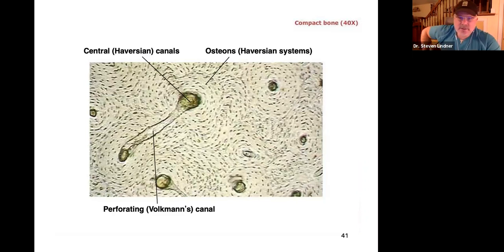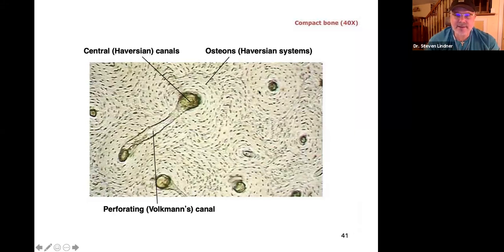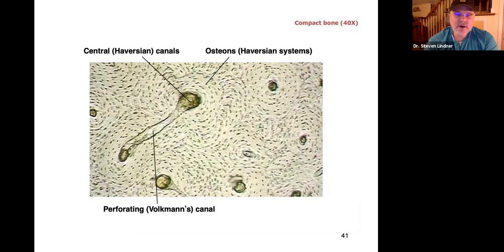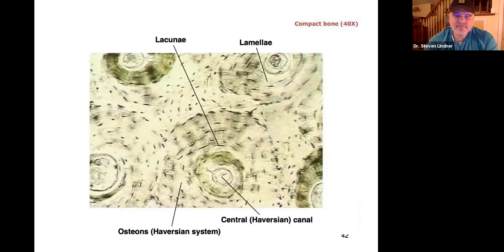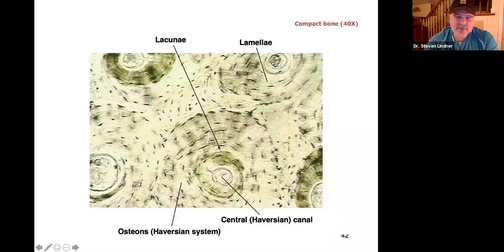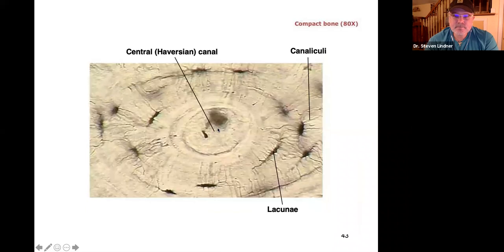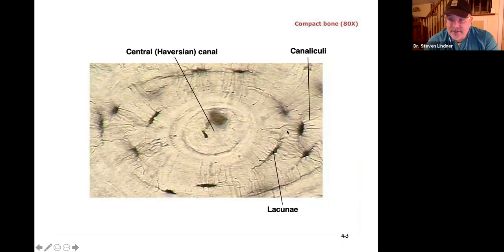This compact bone slide looks like a cross-section of a tree. This is the osteon, with all those concentric rings and the central canal (haversian canal) in the middle. Each little dot is a lacuna where osteocytes are located. Only compact bone has osteons — spongy bone has trabeculae. In a closeup, you can see the canaliculi — those finger-like extensions connecting the lacunae.